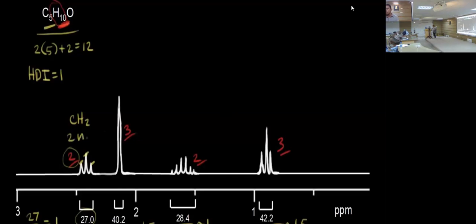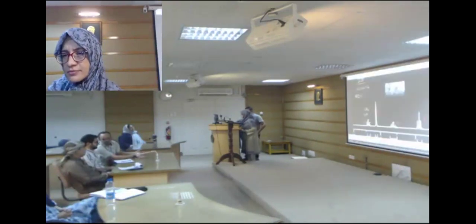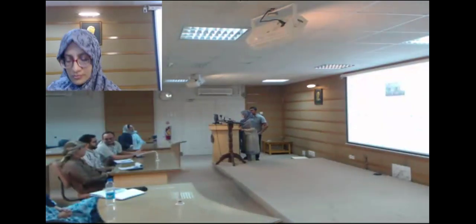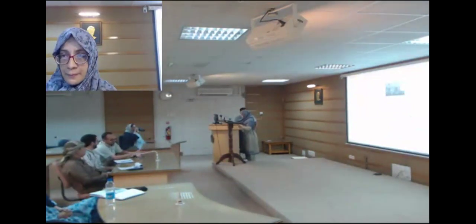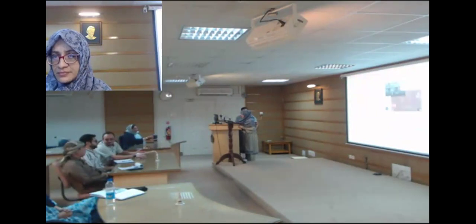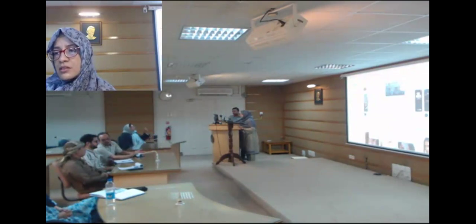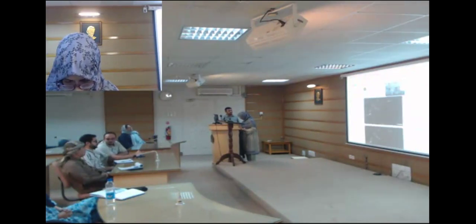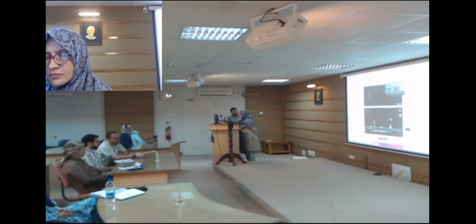My invitation. NMR interpretation. Practice one.